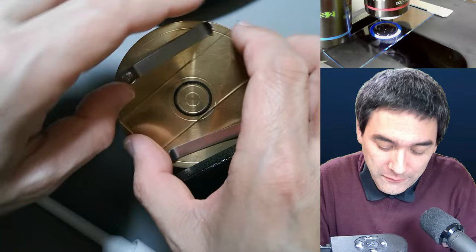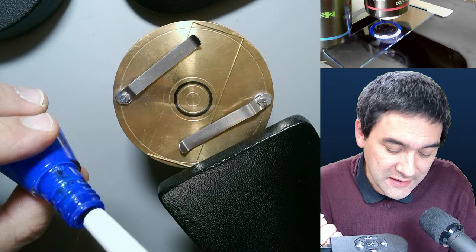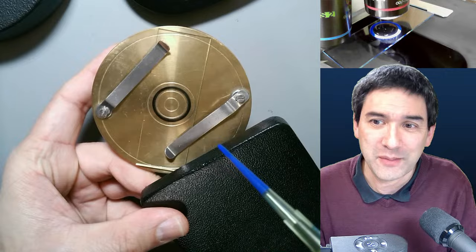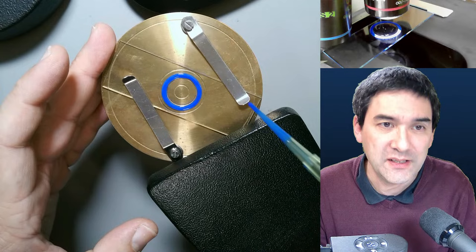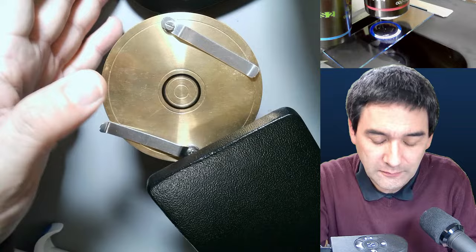Every couple of minutes I'll interrupt what I'm doing and read the comments to answer some questions. When you ask a question, please put @MicroPunter or @Oliver so I know it's for me. I'm going to throw off the tip and put it on the slide warmer. Believe it or not, the first one is already dry — it dried very quickly.